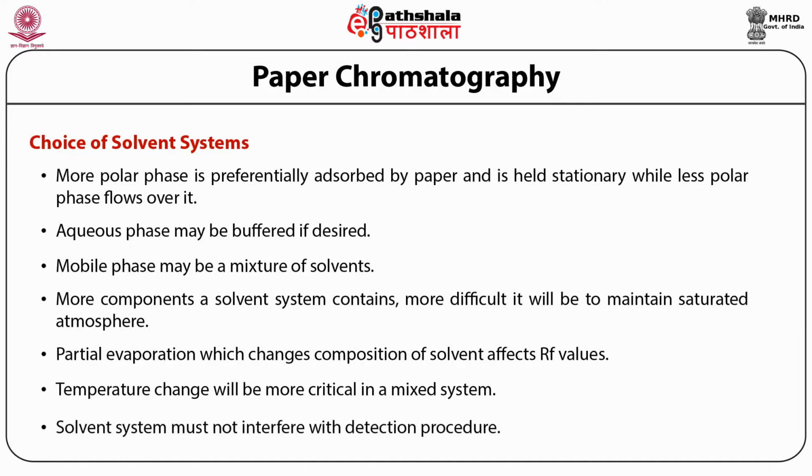The solvent system must not interfere with the detection procedure and must be completely vaporizable so that it can be eliminated before detection. Another very important consideration, which is easily overlooked, is that minute, non-volatile impurities in the developing system can be easily confused with traces in the sample or may interfere in the detection method, so a very pure solvent should be used.